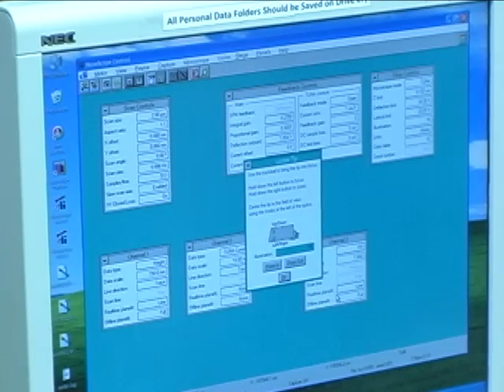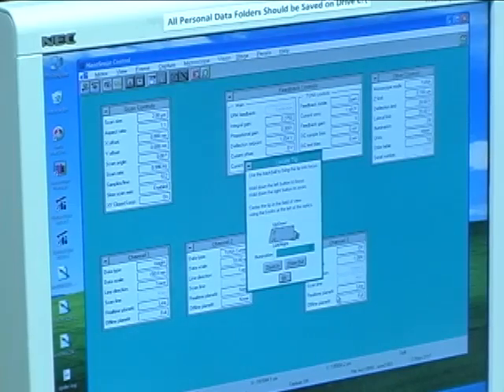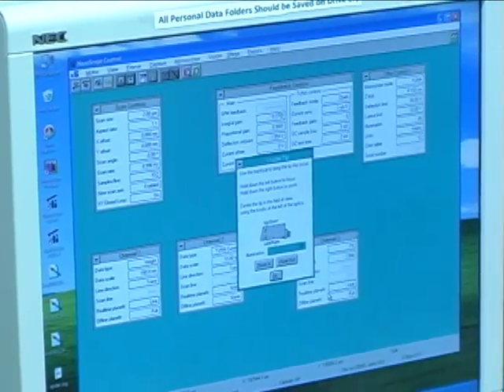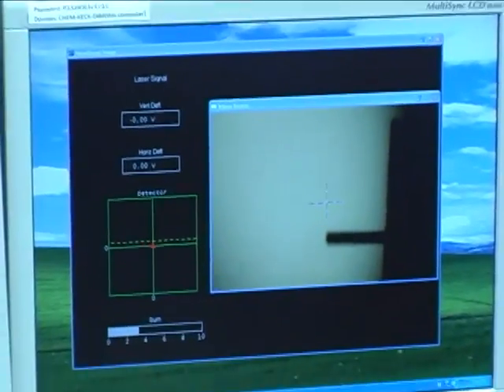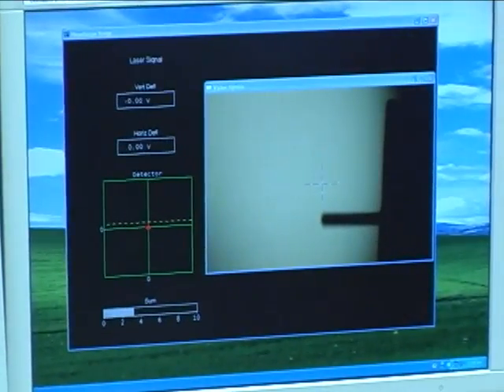We'll use the software to adjust the illumination on our sample until our optical microscope is bright enough to see the image. We'll then use our trackball to focus on the tip.